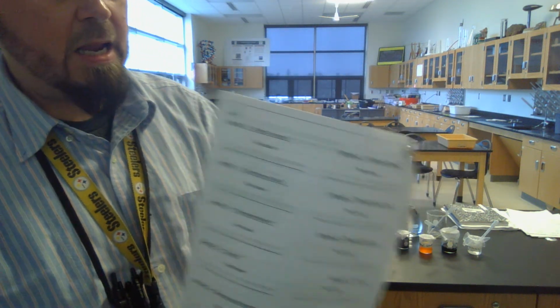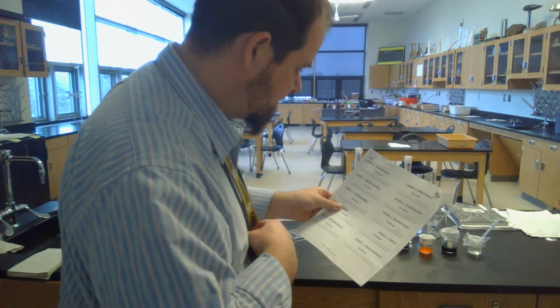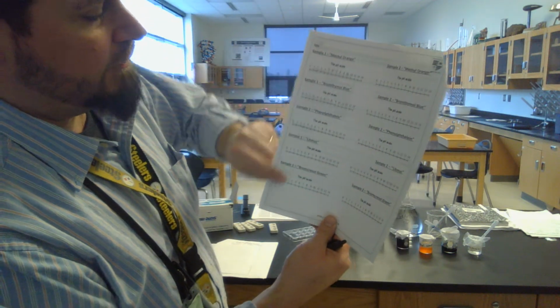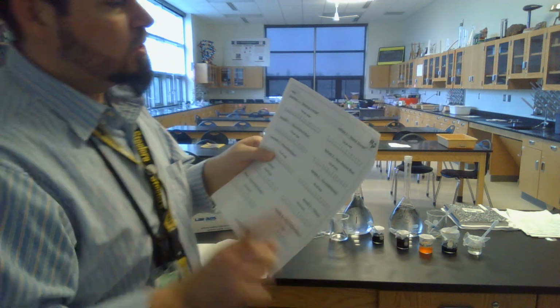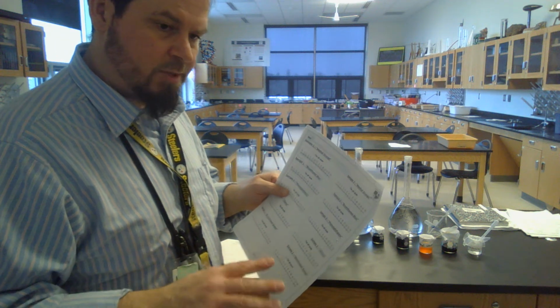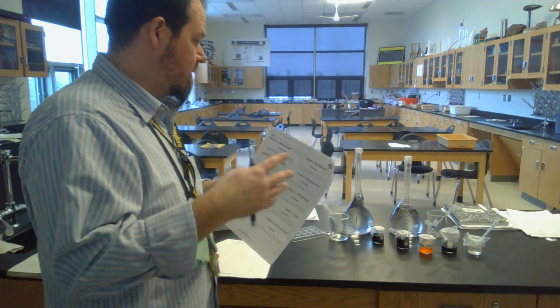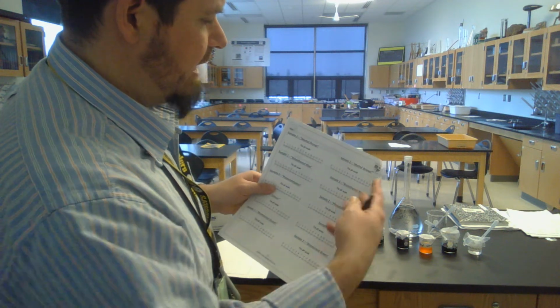All right? And I was not very clear last year, so I want to change some things, and I want to make sure everybody gets this right. So this is what I want you to do. The first sample, notice left-hand side is all sample 1. Second side is all sample 2. So I want you to run one sample at a time. Okay, and you don't have to clean up in between runs. We just want to not run both and get confused. So we're going to run sample 1 and then sample 2. If you want to run sample 2 first, I really don't care. Just make sure you put the data on the right side.